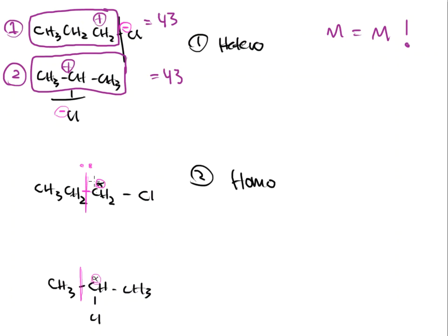When we talk about this bond cleaving, what will happen is that this bond will split and this electron stays with this piece. But we already said chlorine or bromine, if that's the case that I've got, they're electron greedy. They will go out and scour for any electron that they can, and they'll pull it in as close as possible. So this electron, when that bond cleaves, actually gets sandwiched in here between the chlorine and that CH2 group.